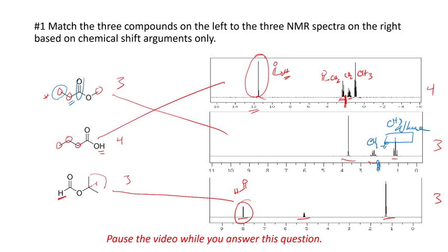And then why is this other peak way over here between 3 and 4? It's because it's on an oxygen. It's this guy. And what about this one down here? Well, we said that this H was delta 8, roughly, 8.1 maybe. What else have we got? Well, we've got an H way down here at 5, which is pretty unusual. But look, it's this one right here.